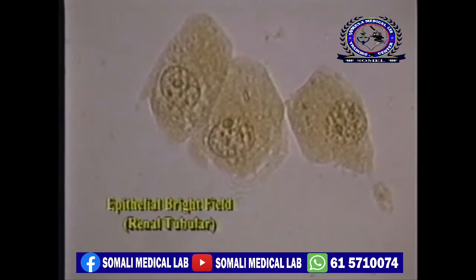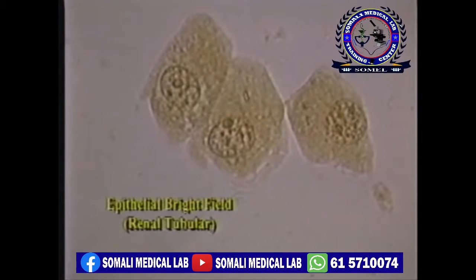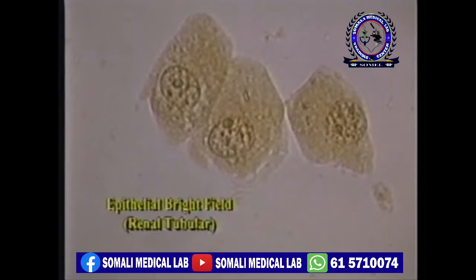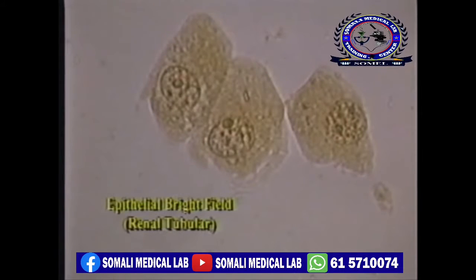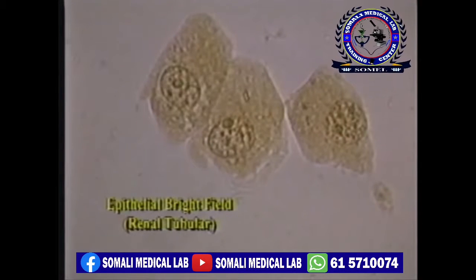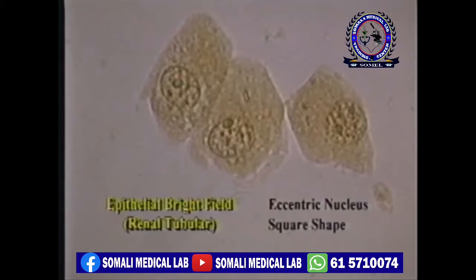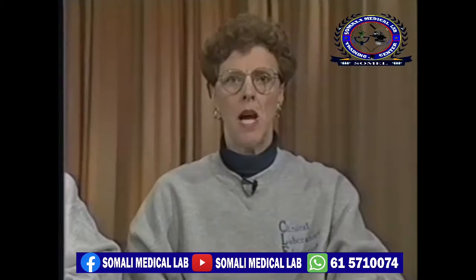The third type of epithelial cell to be differentiated is renal tubular cells, as seen here. This slide is bright field under high power. It is sometimes difficult to separate these from transitional cells. These cells are pretty much the same size as transitional cells, but have an eccentric, obvious nucleus and a square rather than round shape. Now we're going to look at other stuff, things that are not always cellular in nature.